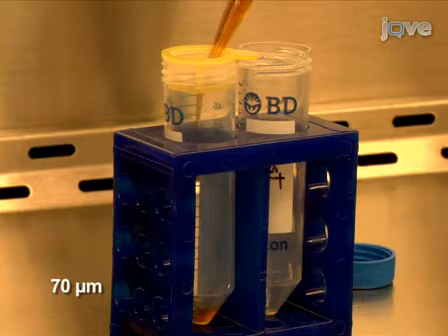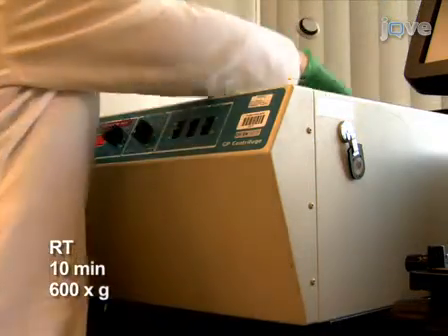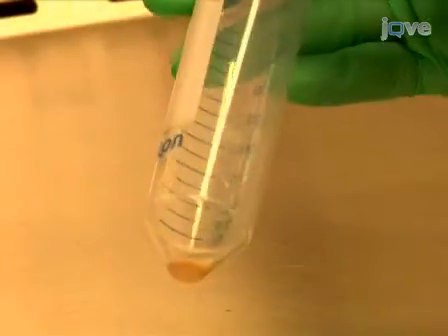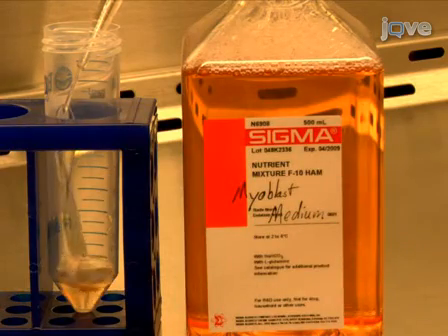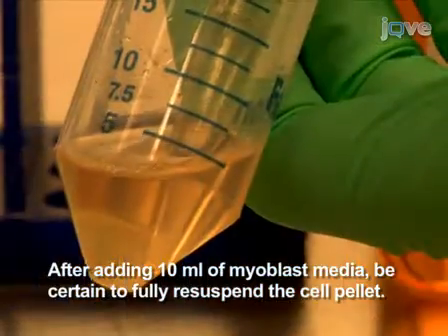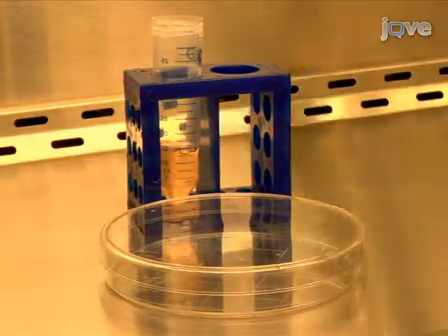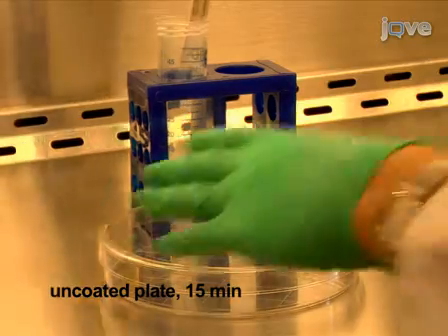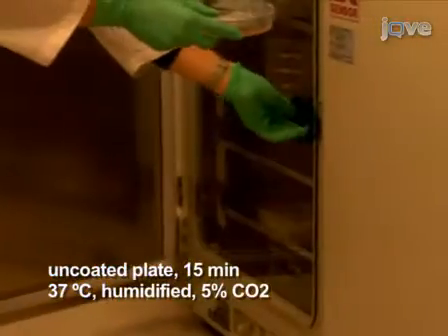Once the muscle is liquefied, pass the solution through a 70 micron cell strainer. Then centrifuge the filtered cells at room temperature for 10 minutes at 600 g. With a Pasteur pipette and suction, aspirate as much of the liquid as possible and re-suspend the pellet with 10 milliliters of warm myoblast medium. Pre-plate the cells on an uncoated 150 mm tissue culture plate for 15 minutes to help remove any fibroblasts, as they attach faster than myoblasts. Place the plate in a humidified incubator set at 37 degrees Celsius with 5% carbon dioxide.